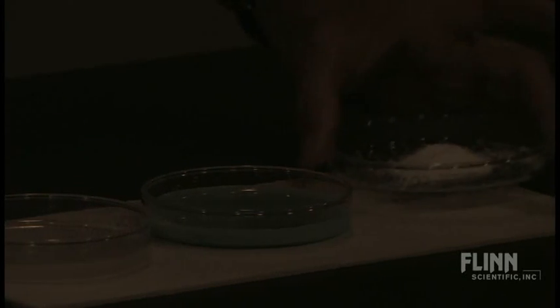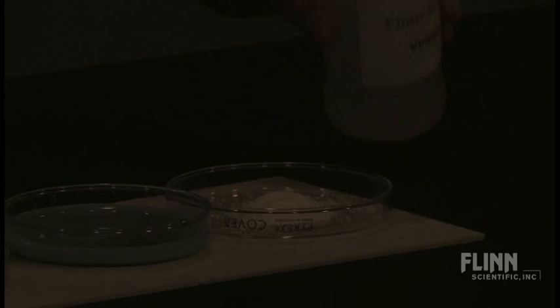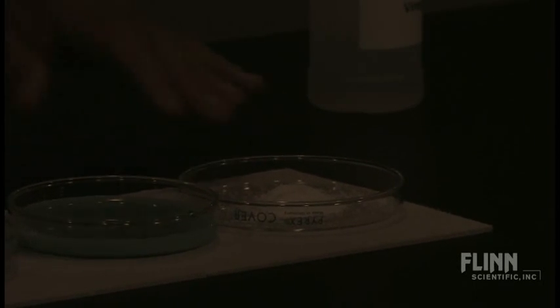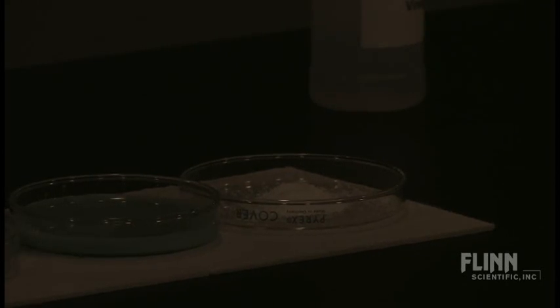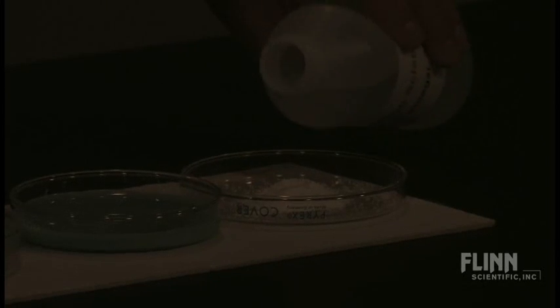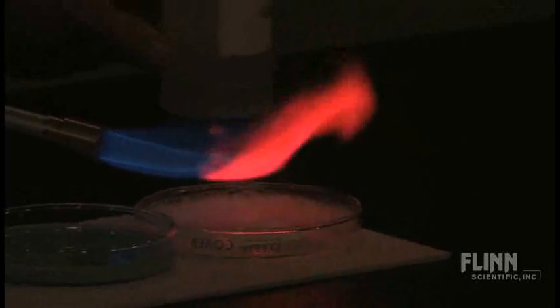And last, this is the lithium — lithium carbonate. Remember that I'm using all carbonates. This helps the students realize that it's not the negative portion of the molecule that's creating the flame test — it's the metals. The metals which have one or two loosely held valence electrons that can easily be excited. Here's the lithium. That's a really nice red. Very obvious.